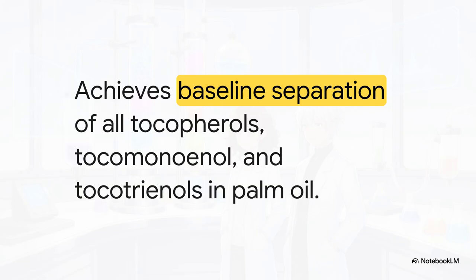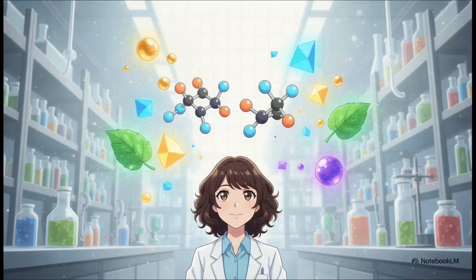By using a precisely tuned normal phase system, researchers are able to achieve comprehensive baseline separation of every single tocopherol and tocotrienol in the oil. It separates them so cleanly, so perfectly, that scientists can calculate the exact true concentration of those cancer-fighting molecules without any interfering overlaps. And its capabilities go way beyond palm oil.